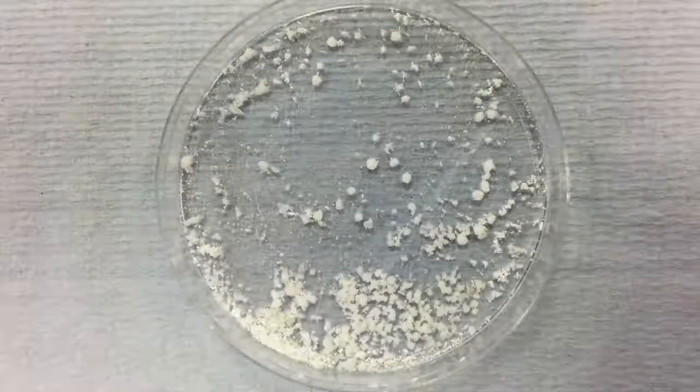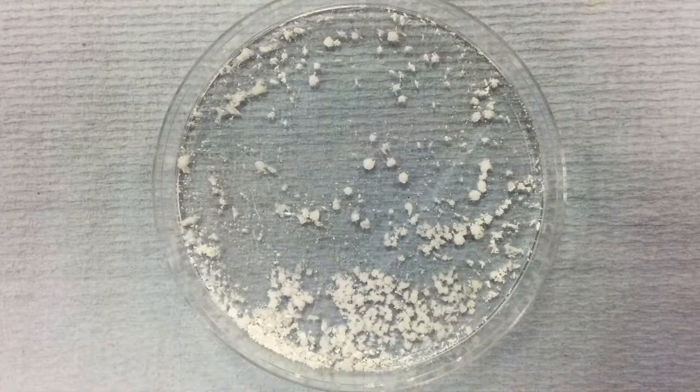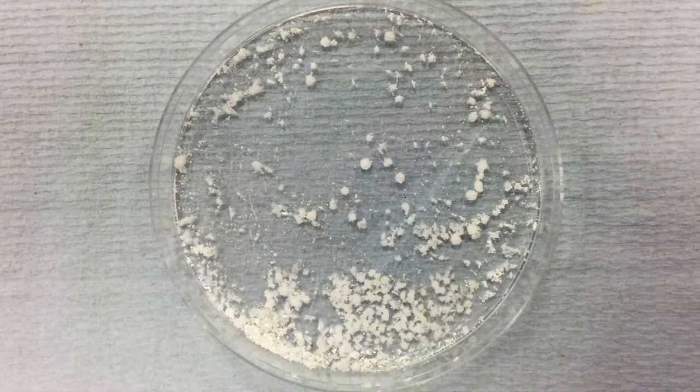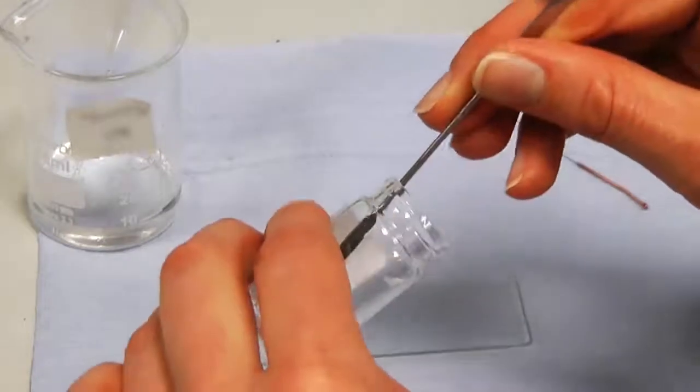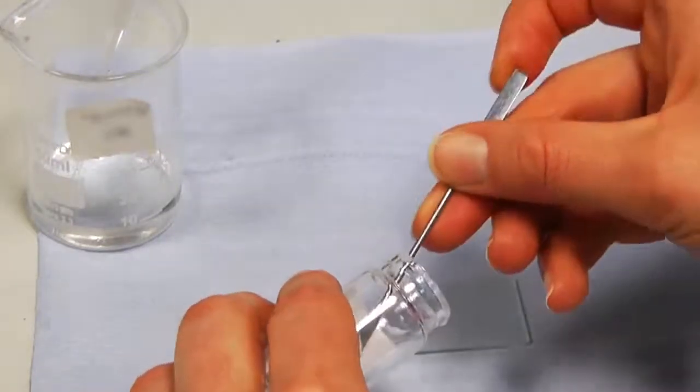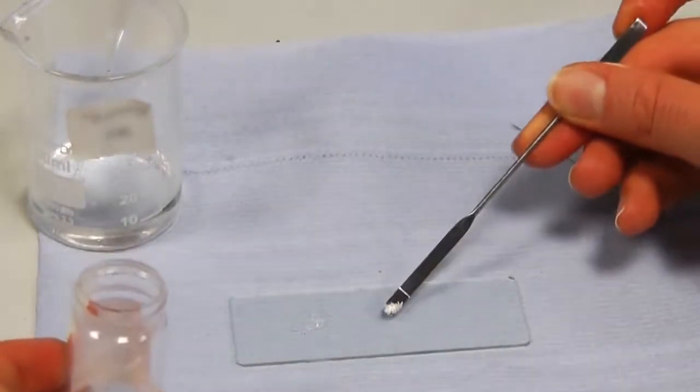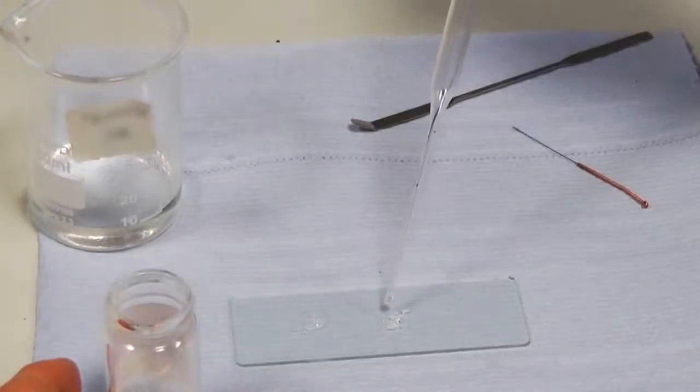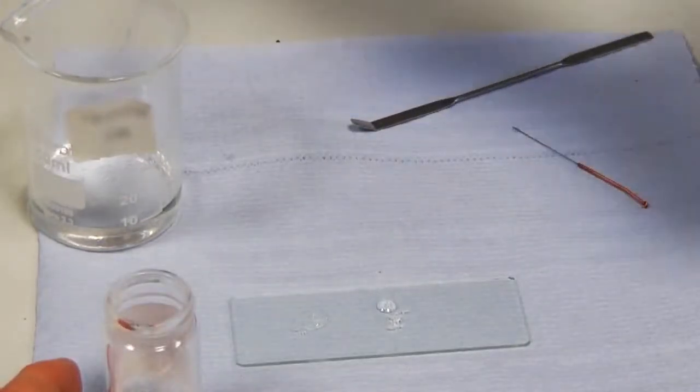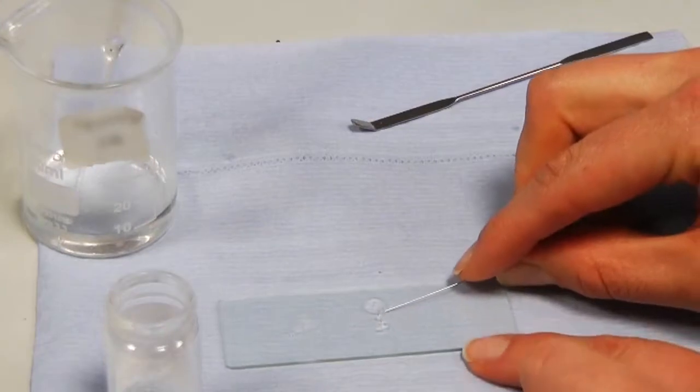First, you will need to recrystallize your sample to obtain single crystals of adequate size for analysis. Once suitable crystals have been obtained, use a spatula to paste a few on a glass slide. Placing a drop of paratone oil onto the crystals will make it easier to manipulate them and select the best candidate.